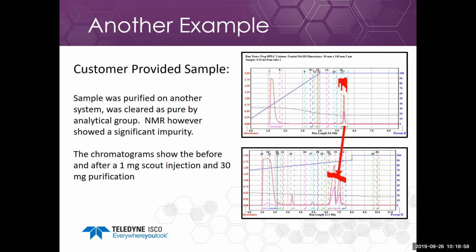I will explain shortly why the peak is not centered over here, and the peak shape actually gives a bit of a clue about what's going on. However, the compound did elute on the focus gradient, and we were able to resolve a hidden peak from the desired compound.